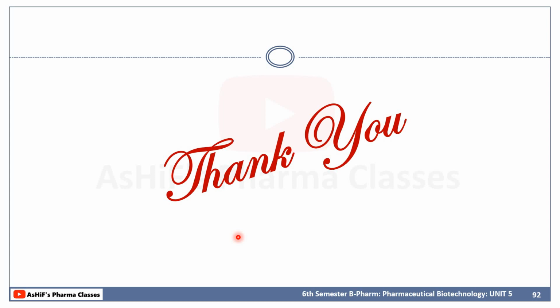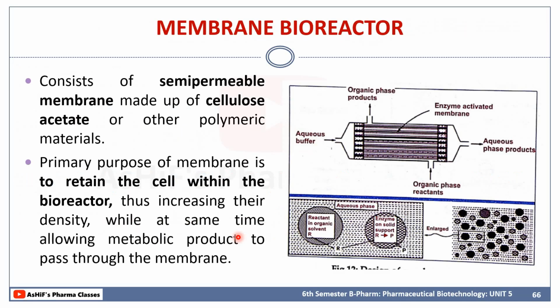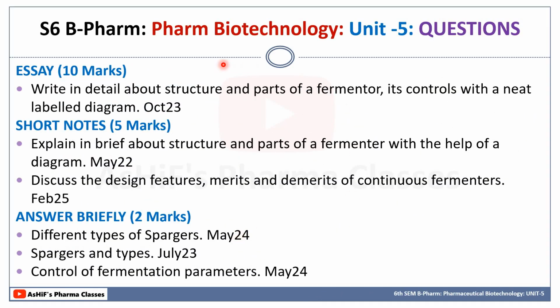So that's all about the fermenter, types of fermenters, and different operations of fermenters. This is a very important topic. There are many questions from this area, as you may already be aware. I have already shown you different questions from this area, like the detailed structure and parts of the fermenter and its control with a neat labeled diagram, and explain in brief the structure and parts of the fermenter with the help of a diagram.